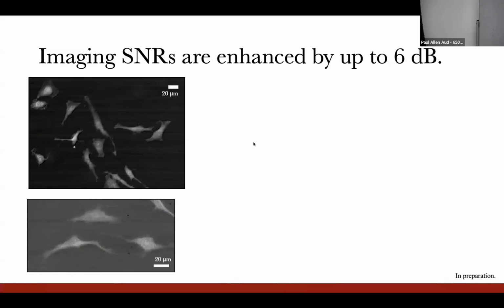But of course, I told you that the interesting thing about Raman spectroscopy is that we also get this spectroscopic information. And so this carbon-hydrogen stretch regime that we're probing is very busy for biomolecules, particularly in cells. But there still are characteristic features that correspond to different macromolecules. So a lot of work has gone into understanding just how, for example, the abundance of carbon-carbon double bonds in something like a lipid shifts the vibrational resonance of a carbon-hydrogen stretch.